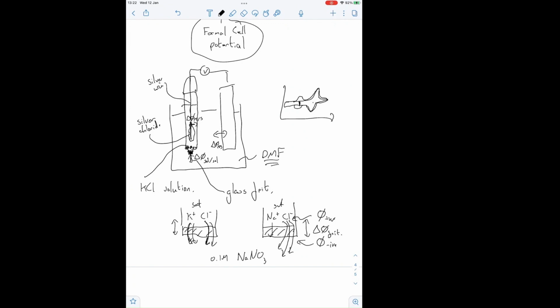So when I'm measuring the potential difference across this whole circuit here, this I don't need to worry about. And that's why I choose to use potassium chloride, or typically choose it if I'm doing good measurements. Now, there's another reason for not using a silver chloride or a calomel electrode, and that's if I'm doing corrosion measurements, a sniff of chloride will change corrosion of iron massively. So be aware that chloride is entering your system, and it will actually change your corrosion measurements.